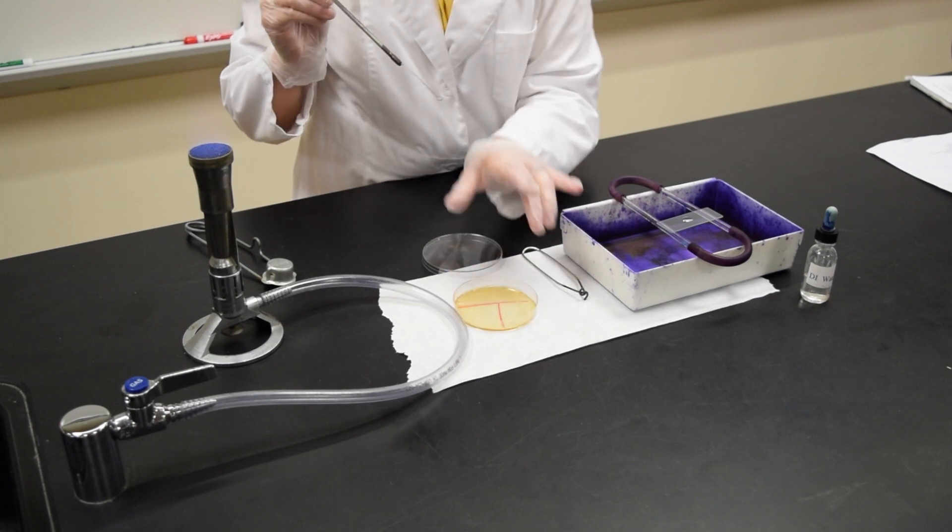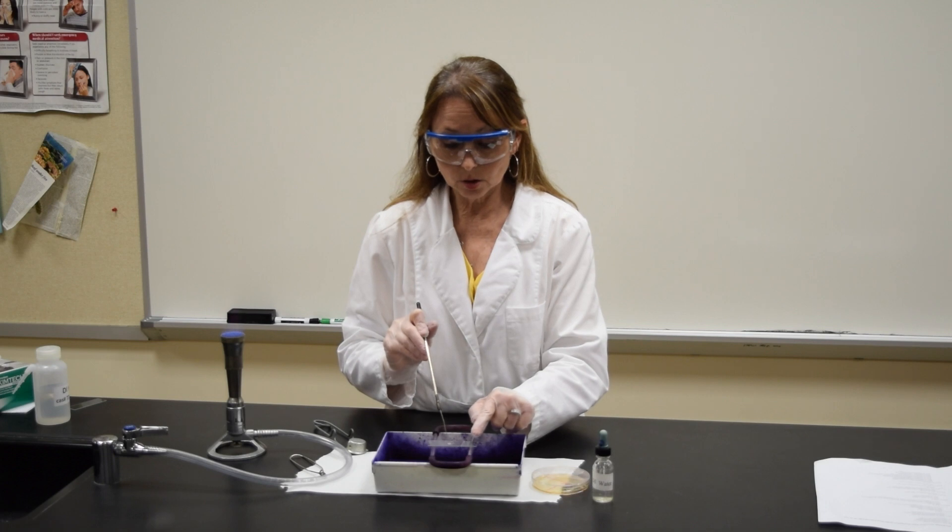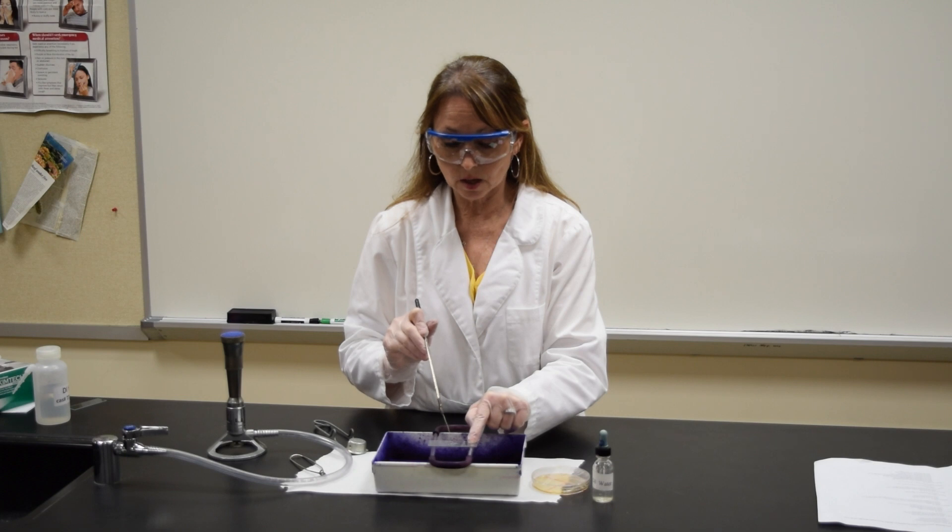Touch the surface of a colony, then put the lid back on the plate. Take the loop with your organism and put it in the drop, spreading it around the size of a dime.